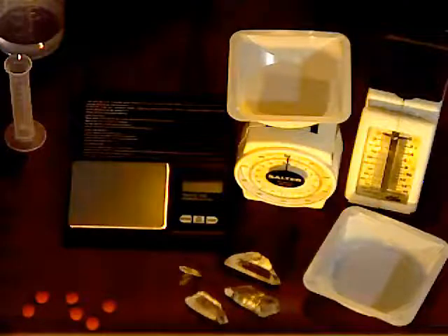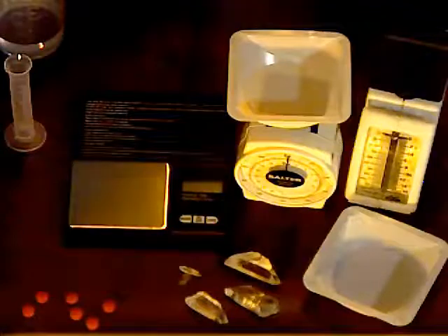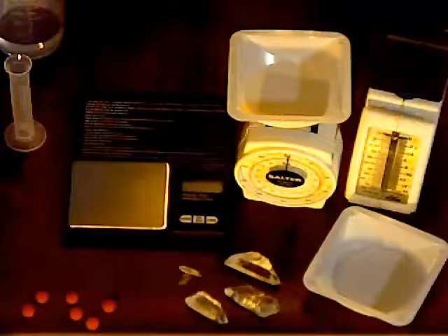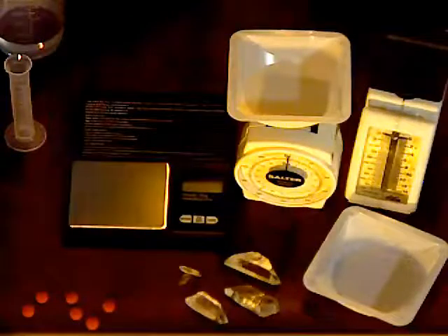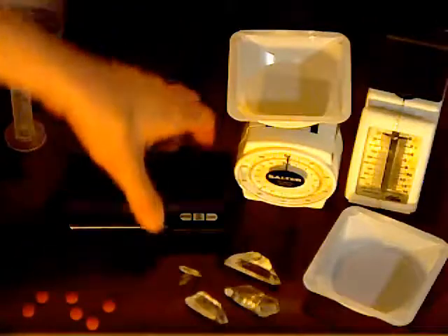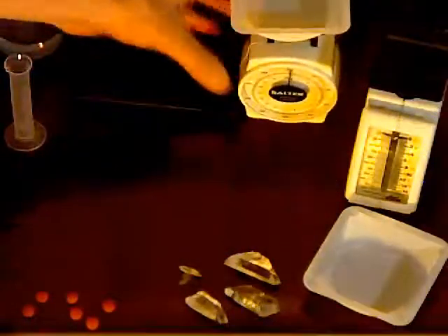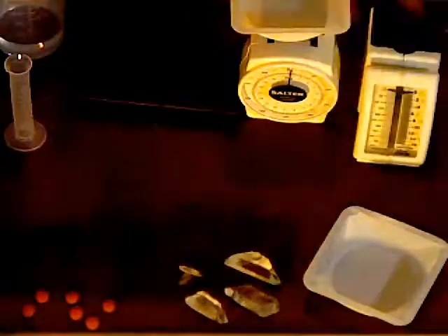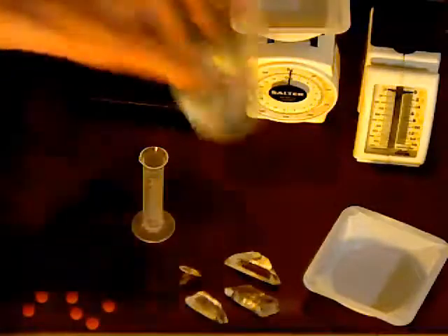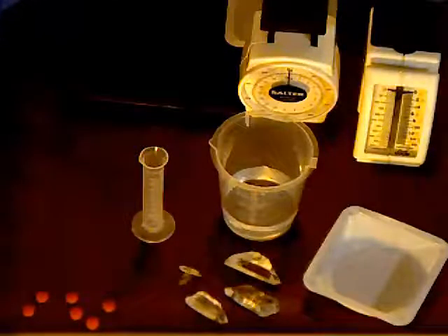If I want to measure the volume, there are a few different ways I can do this. Perhaps the easiest way is to use volume displacement. Now, I could use rulers and some fancy math equations, some geometry, and determine what the volume is based on the measurements I make and knowing the shape of these different crystals. But that would be rather challenging. There is a better way. And the better way is volume displacement.